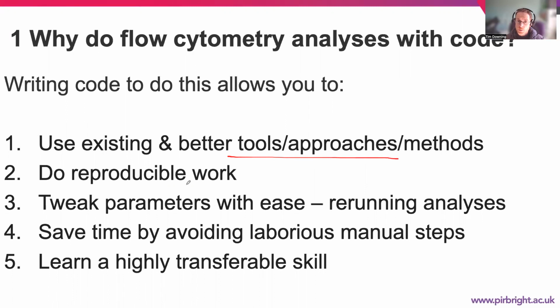You can do reproducible work. So if you need to rerun things, that's fine. And that links to point 3, that you can tweak parameters and optimize things many, many times. You don't have to worry about doing things just once. You'll avoid laborious manual steps.